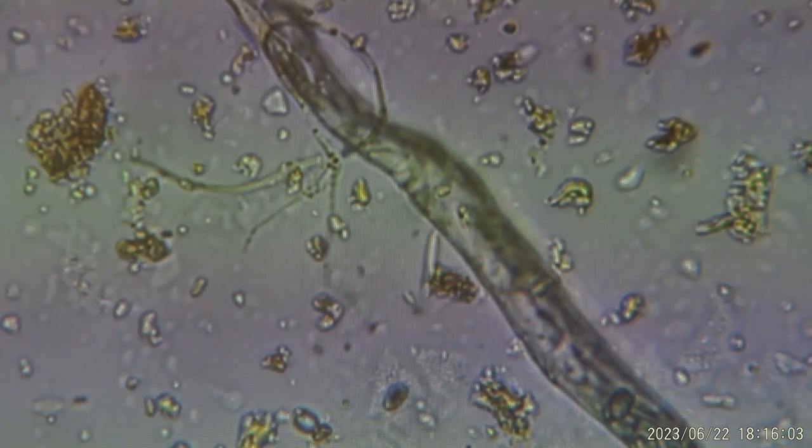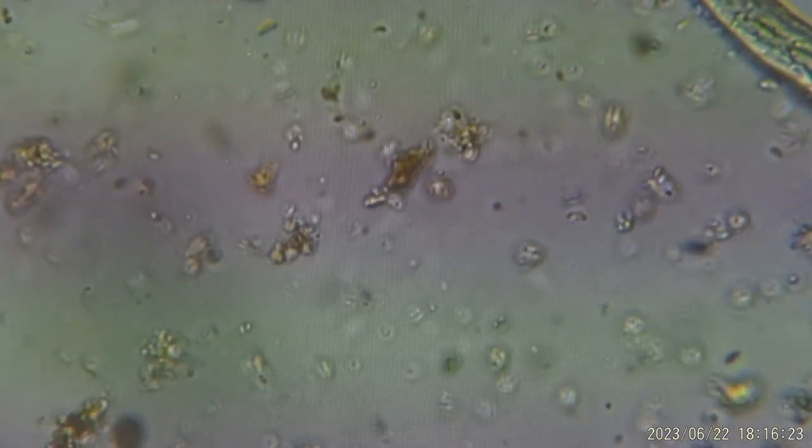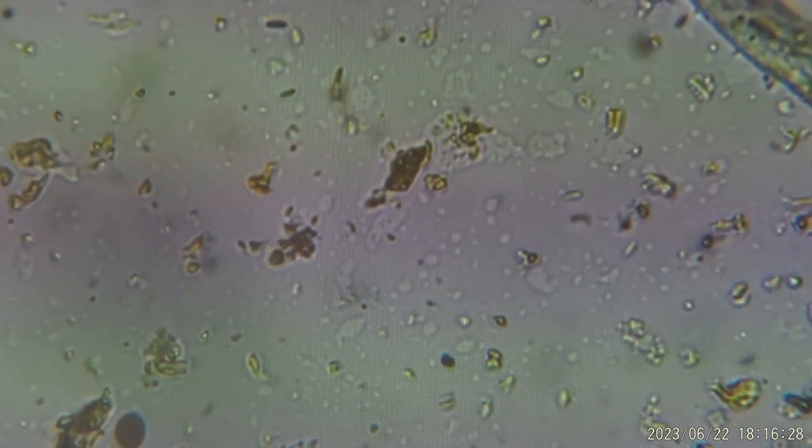Oh, something going on down here. This is perhaps actually another protozoa, but hard to tell. Sometimes they get shy when you're looking at them. This one's getting a little camera shy here. Oh, here we go.